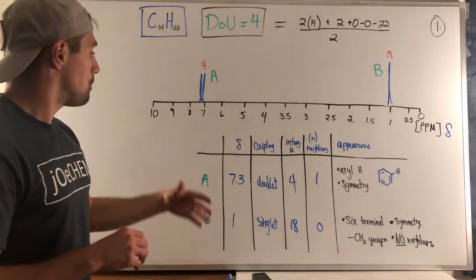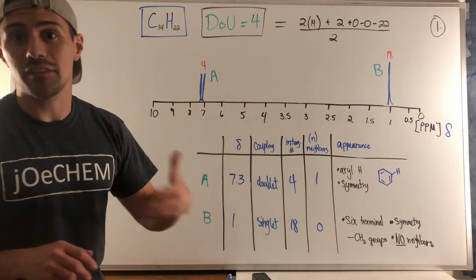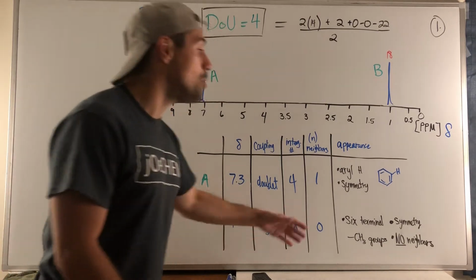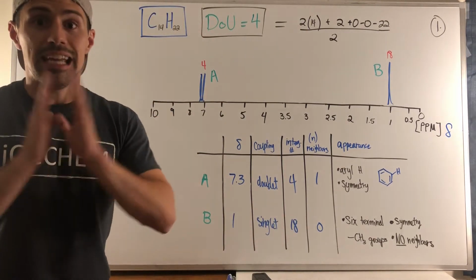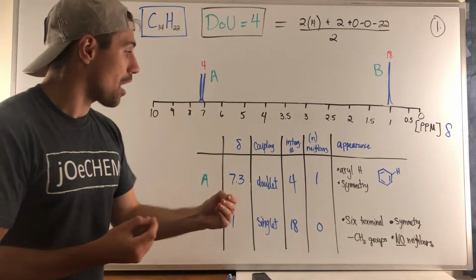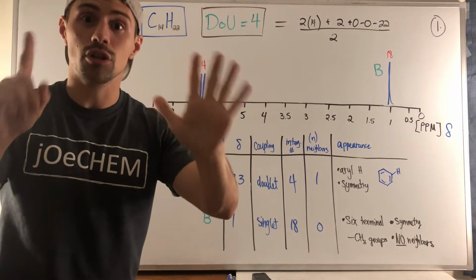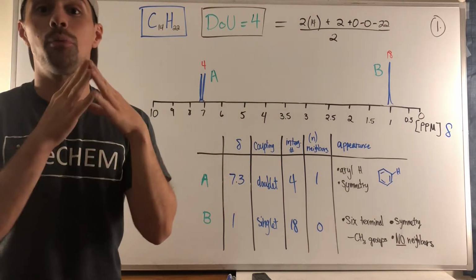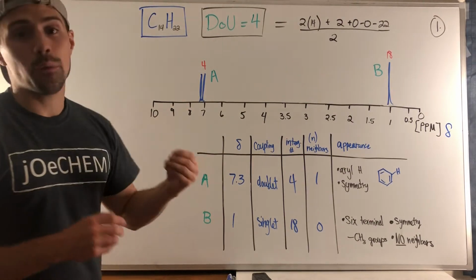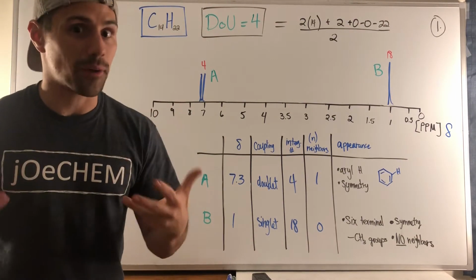Okay, so you have that going on, as well as the massive peak that corresponds to 18 hydrogens. It's smack dab on 1. It's a singlet, no neighbors. This is key. This screams terminal CH3 with no neighbors. If this is a CH3, then we must have 6 terminal methyl groups. If you are coming from Part 1 of the NMR drawing worksheets, we saw how we could have that if we had a t-butyl group. So if we had 2 t-butyl groups, this might work out for us.